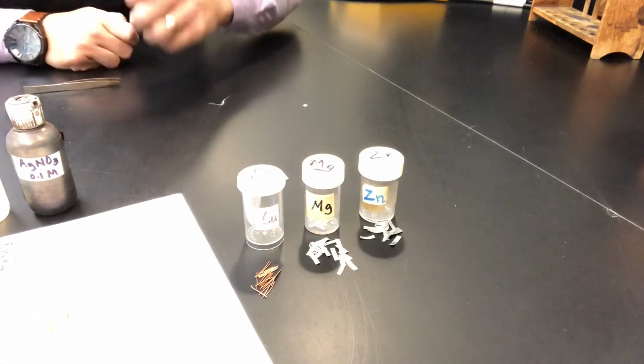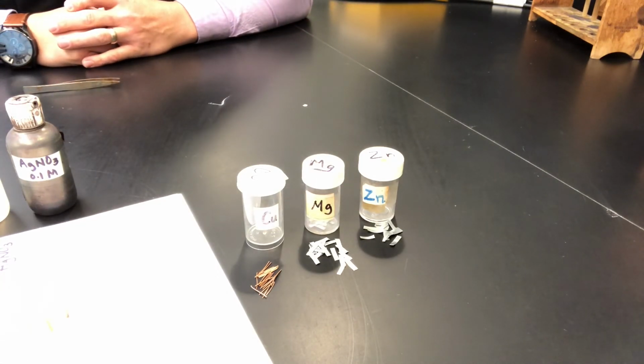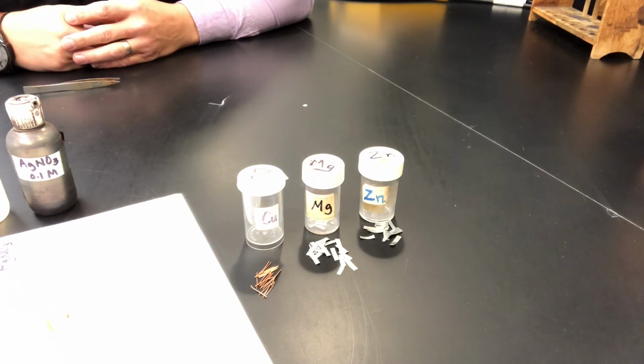Now, we'll need to mix them together, so I'm going to move the camera so we can set up the lab, just like in your lab data table. And then after we let it sit for 5 minutes, we will see if anything reacts and take note of that. So let's get the lab set up.